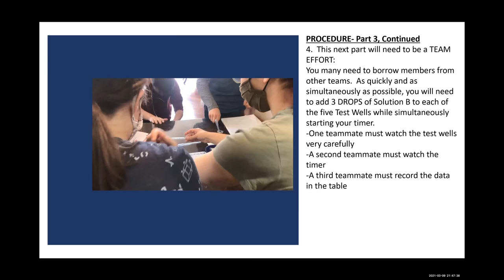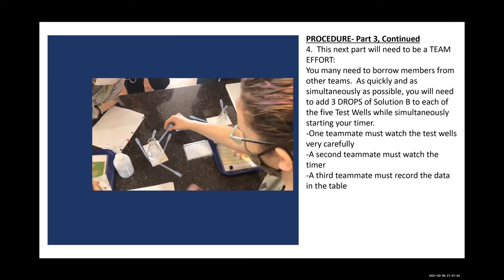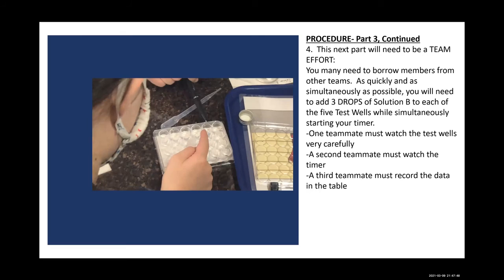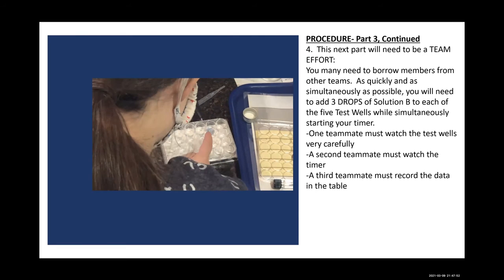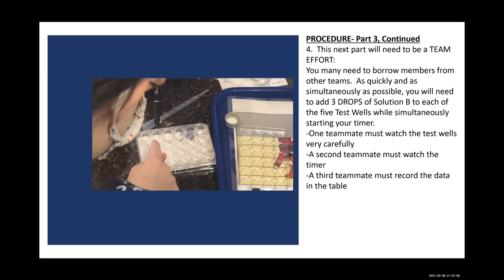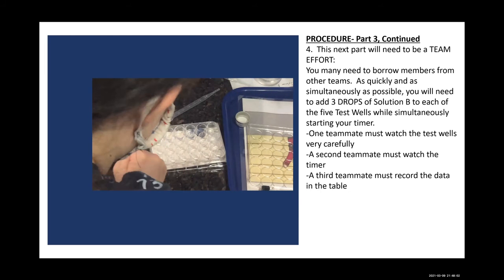Alright, Cole, tell me the timestamps. Bailey, make sure you write down what Cole's saying. Cole, what time is it? 15 seconds, test tube 1 has some blue residue. 21, test tube 2, a little bit. 25, test tube 4 has more than test tube 3. 22, good observation.